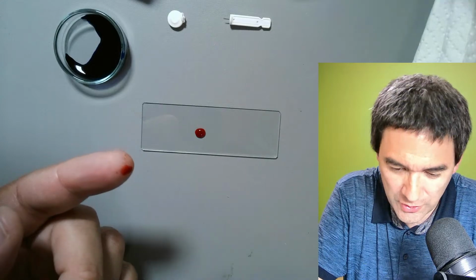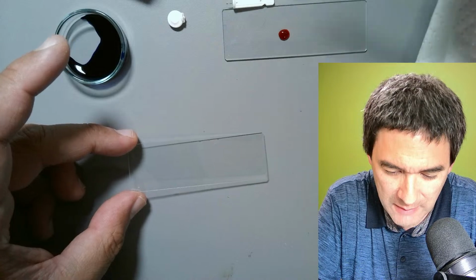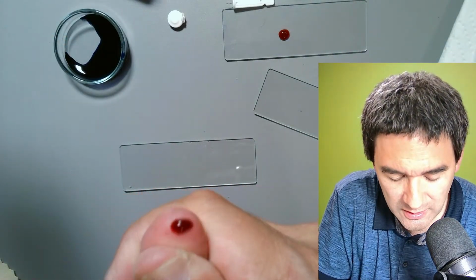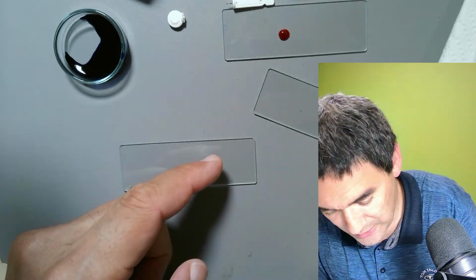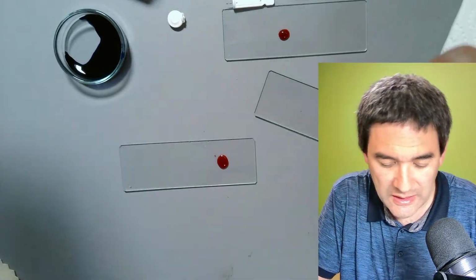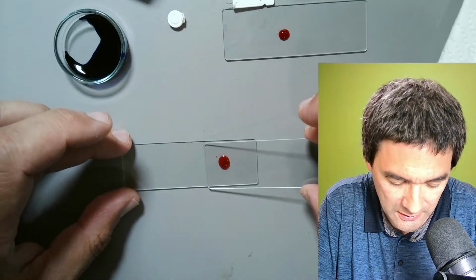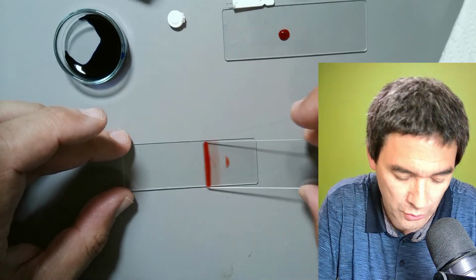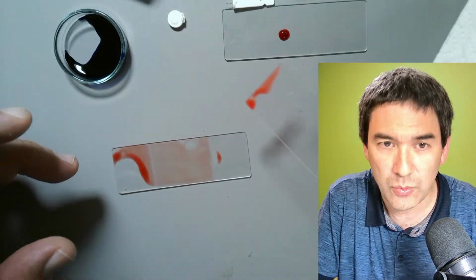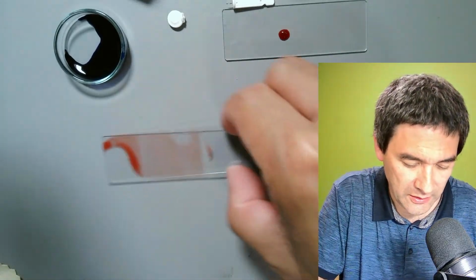You know what? Just for the sake of it, I'm just going to show you now how you could actually make a blood smear. I'm just going to demonstrate this as well, how they do that. If you want to also stain it, you put a drop of blood on one side. You take a second microscope slide and do the following. Do it like this, and then you go. Okay, and then you allow this to dry, and then you can stain it as well. So I'm going to discard this. We can have a look at this as well later on.